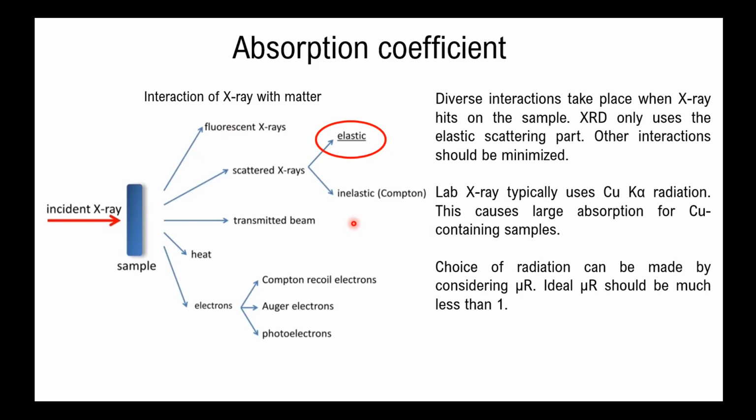We have some synchrotron time, and we have some specific sample, and we cannot always presume that synchrotron is the best radiation for this sample. It may not be true, right? Practically, that relates to the calculation of the muR value, which is also something you encounter in X-ray diffraction software, and something I'll show in the next slide.